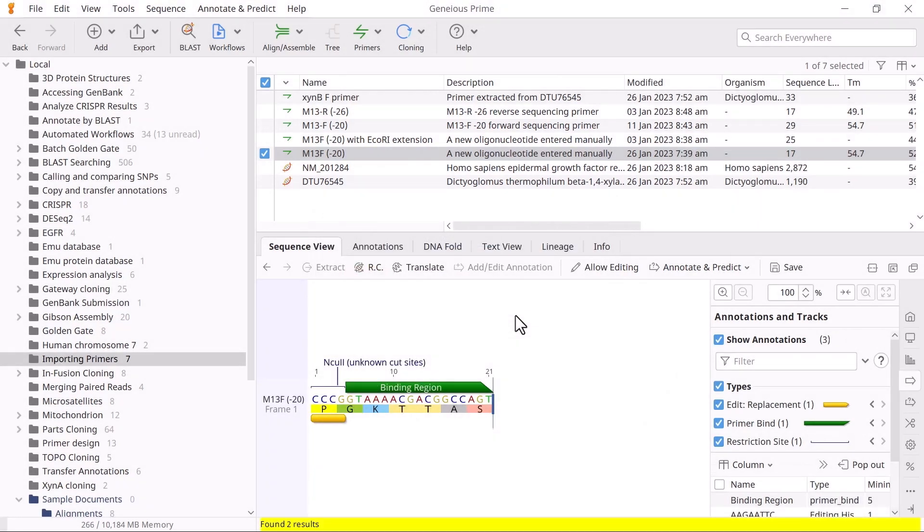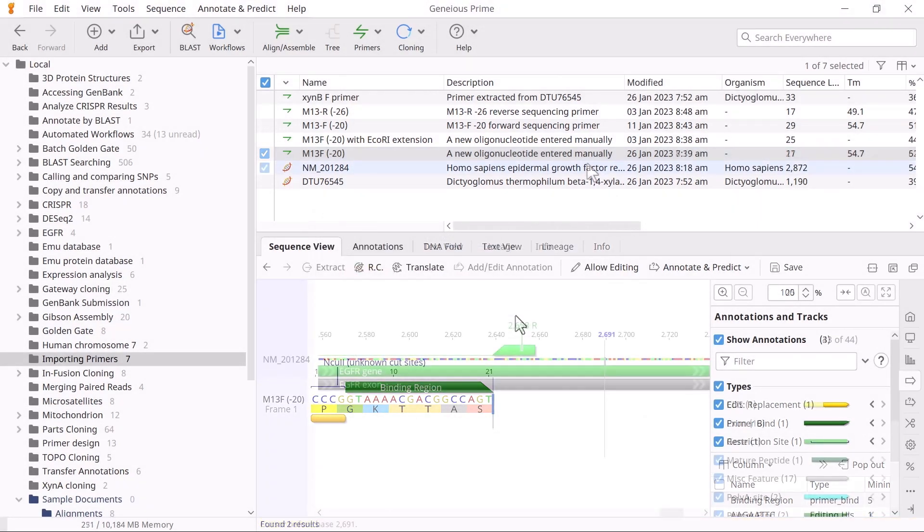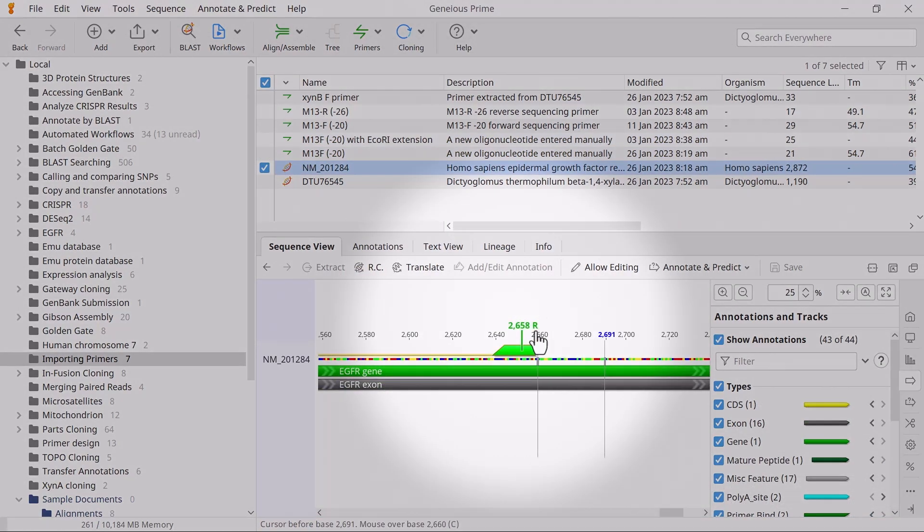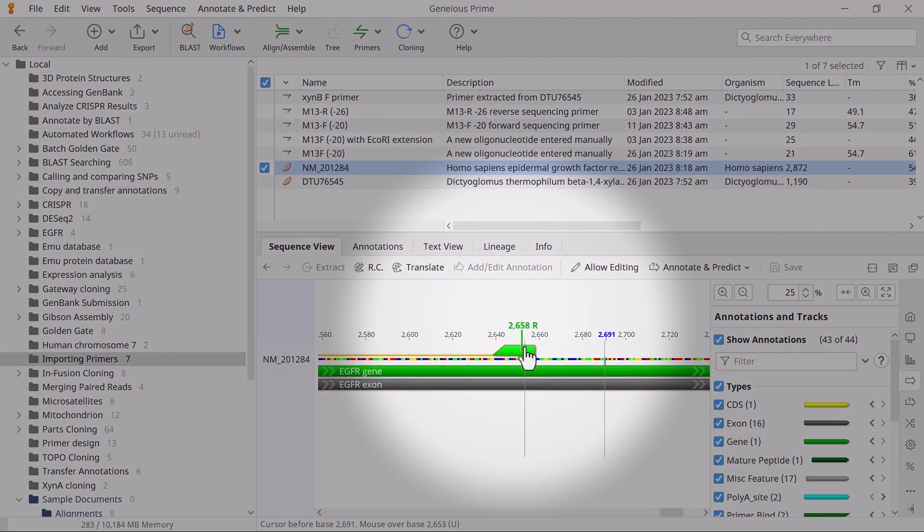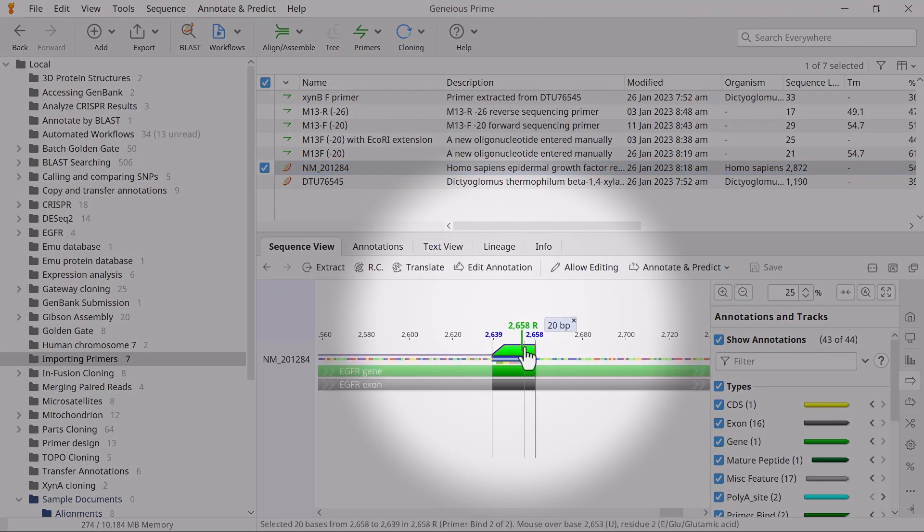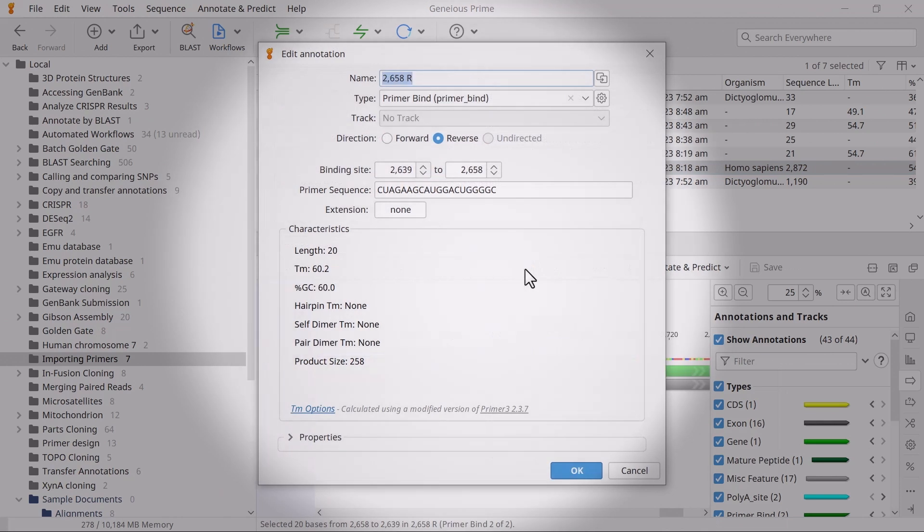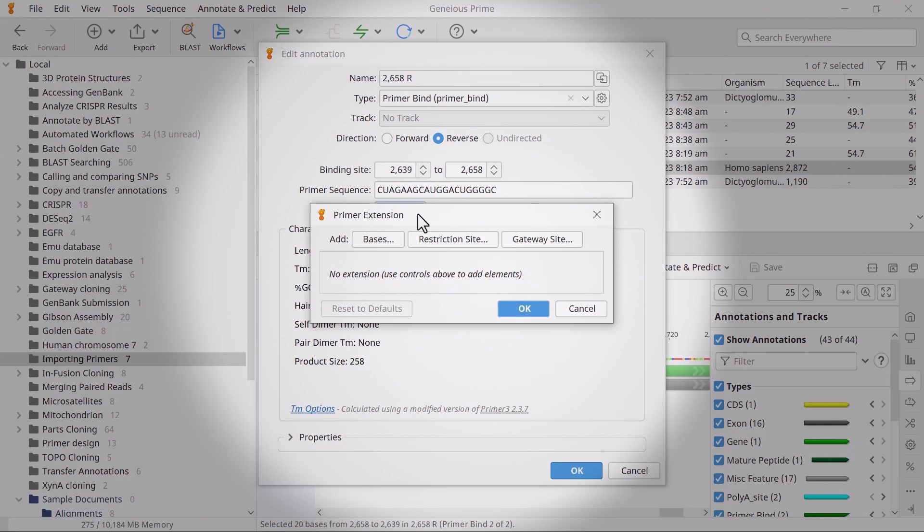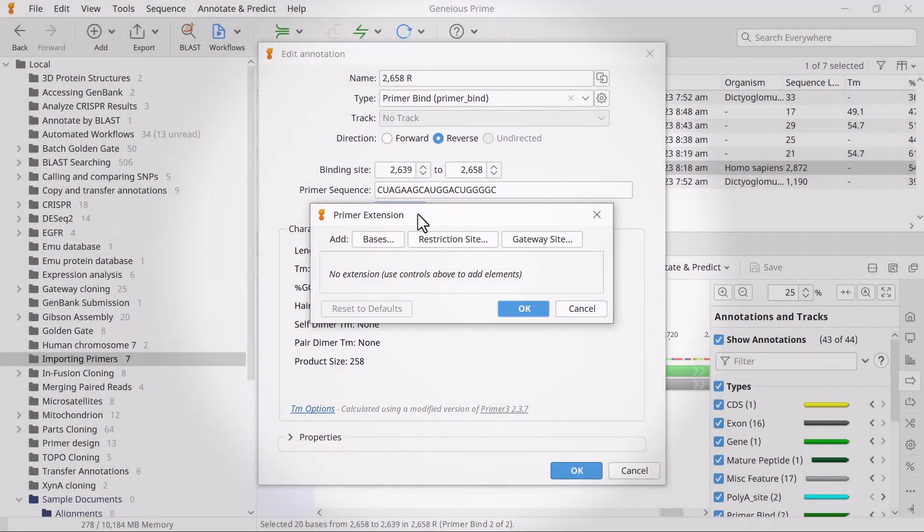For a primer annotated on a sequence, select the annotation and use the Edit annotation button in the Sequence view or double-click the annotation to add an extension. In the new window, select None next to extension to specify your extension sequence as before.